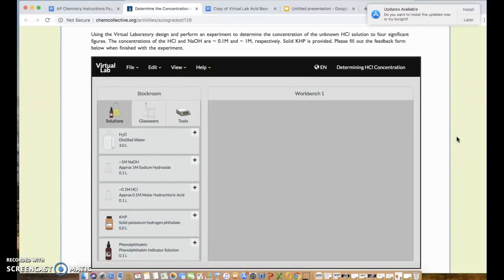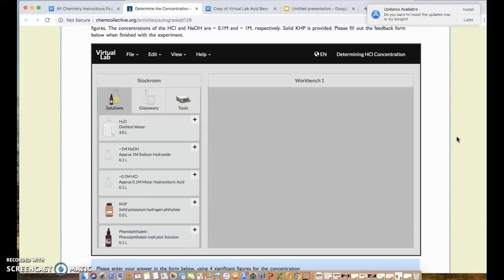This virtual lab simulates all the glassware, chemicals, and materials you'd use in a real lab. The good thing is there's no cleanup, but you will need to know a few things about how to use it. After I demo part one, I'll get you started on part two, and then you can either watch and do it with me or do the lab afterward. I'll also put up some key things to remember at the end.